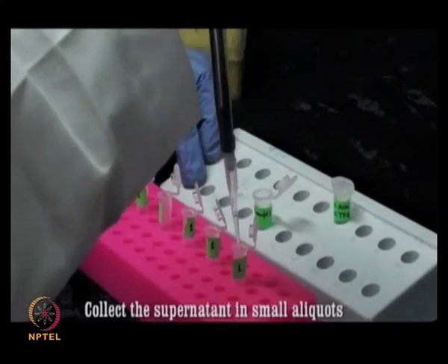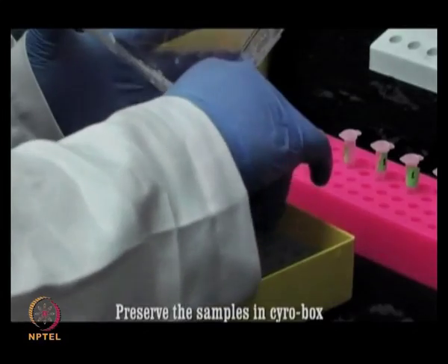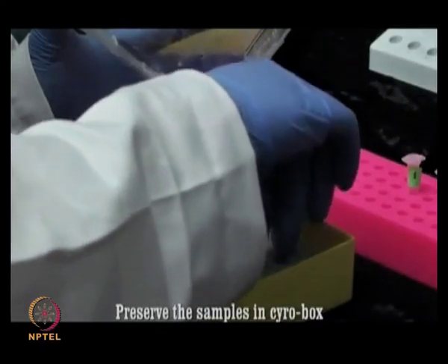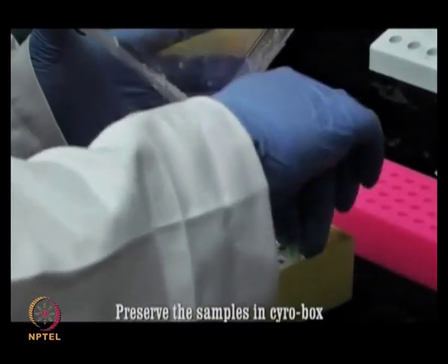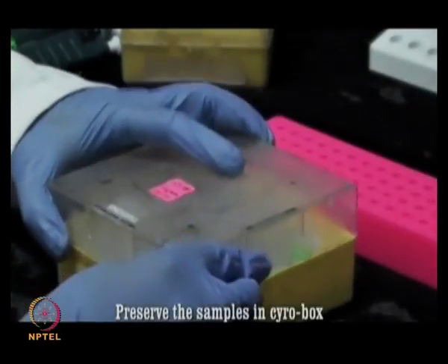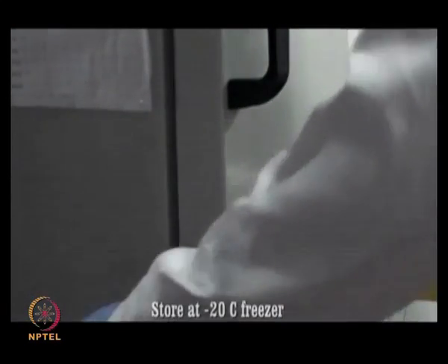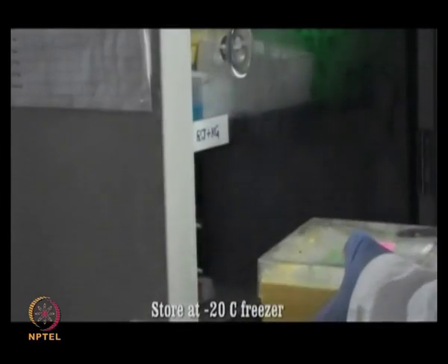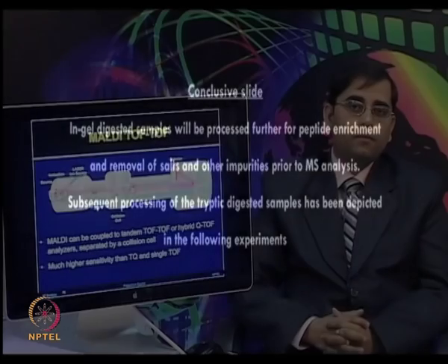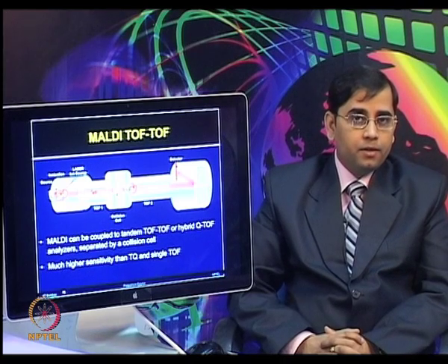Now, all the solution volumes described in the protocols are recommended volumes, but depending upon the experimental requirement, you can optimize and change these volumes and the incubation timing according to your experimental requirements. Now, these samples can be stored and used for further mass spectrometry analysis. So, now you are clear with how to perform the MALDI-TOF experiment.